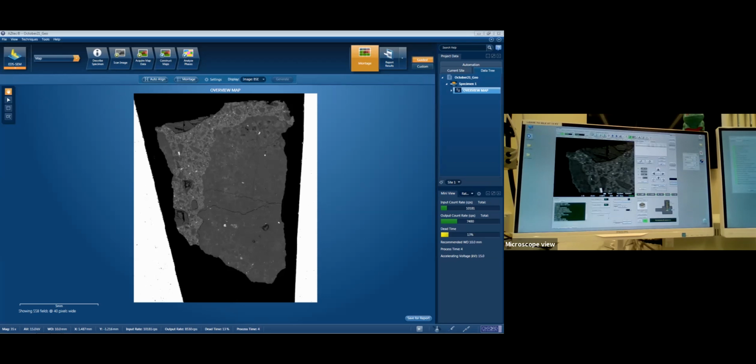So last night we basically left the SEM running and we got a picture of the whole rock that we've got in there. It's not a very big rock, maybe 1.5 centimeters long. This is a backscatter image. We've got these bright bits here, which are really heavy, and these darker bits, which are made out of lighter elements. These two big white stripes are copper tape we're using to hold the sample down in the sample holder, because the last thing we want is for it to fall off inside the SEM, because then we have to go in there and get it back, and that takes a very long time. It's very hard. So we make sure everything is stuck down really well and is also really conductive.